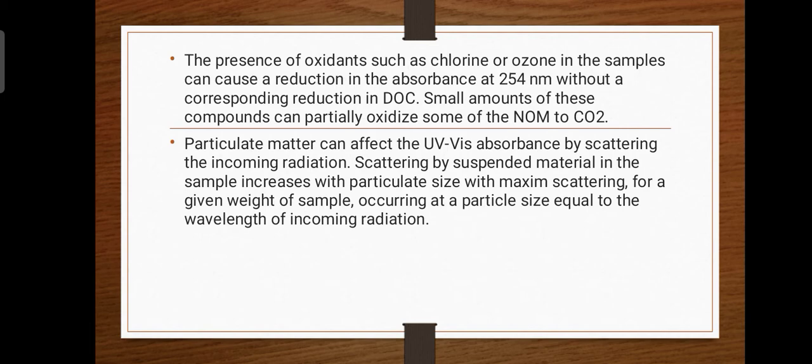For example, the byproducts of chlorine addition to natural water can result in dichloroacetic acid and trichloroacetic acid. It also has been shown in laboratory experiments that ozone addition to fulvic acid solutions causes a reduction in absorbance at 254 nanometers.